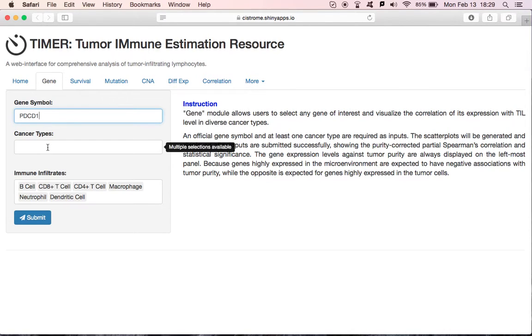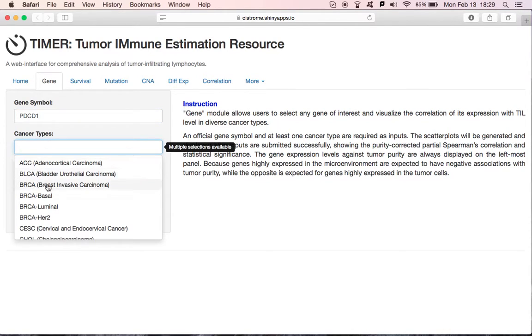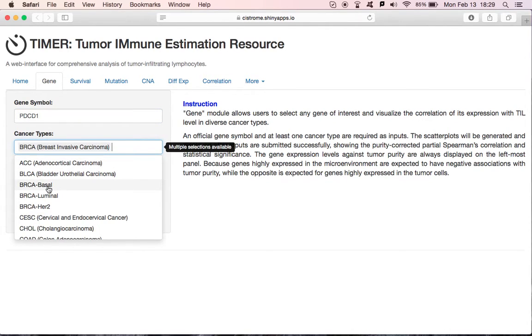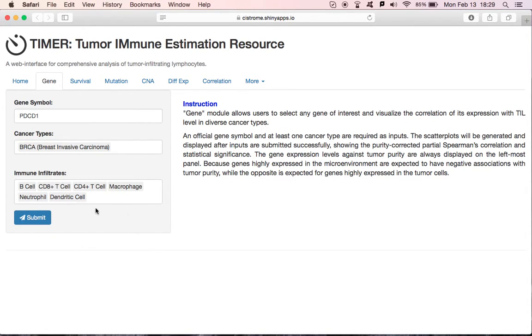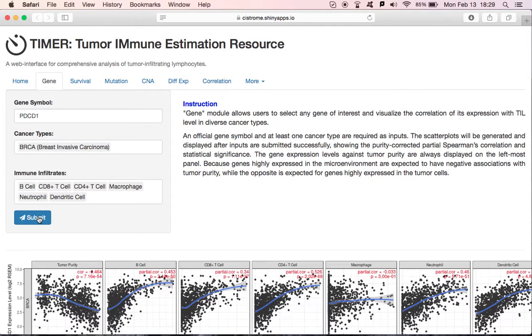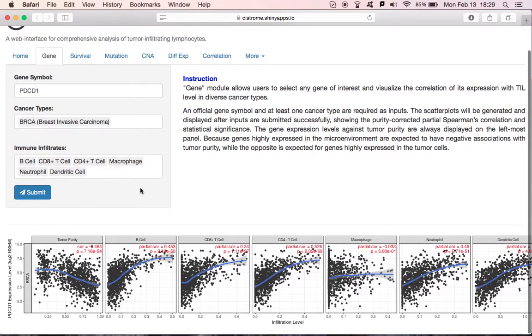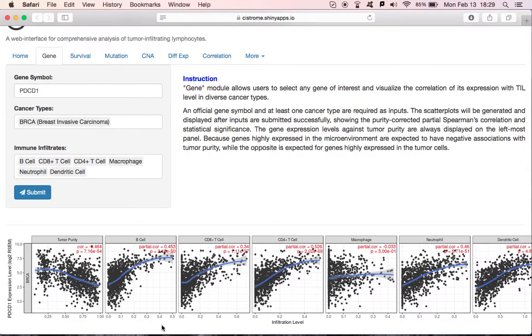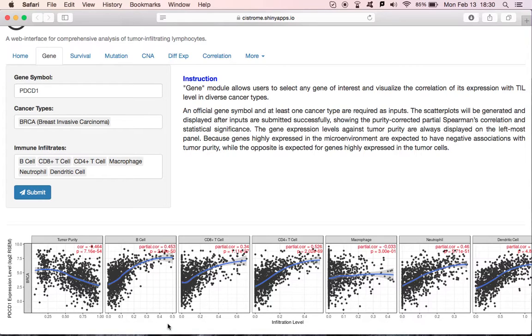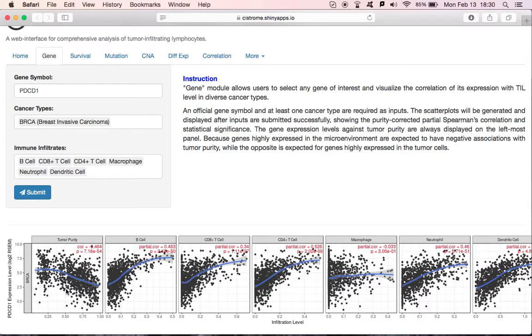Then choose one or more cancer types. Use the default for all immune infiltrates. Check the submit button. You can see there are a number of scatter plots generated below. The x-axis is the level of infiltration for each of the immune infiltrates you selected, like B-cell, CD8 T-cell, and so on. We always display the gene expression level against tumor purity on the leftmost panel, because genes highly expressed in the microenvironment are expected to have negative associations with tumor purity.